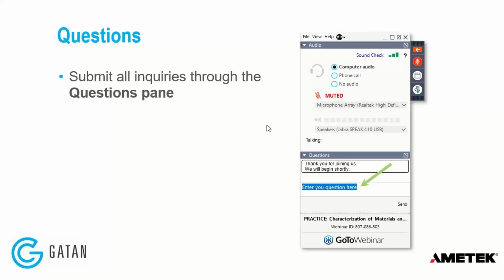Sure. Thank you. And another question is, what were the settings to collect CL data? So the dwell time per pixel was something like 0.1 seconds, 375 by 375 pixels. The beam was around 10 kV, I think.